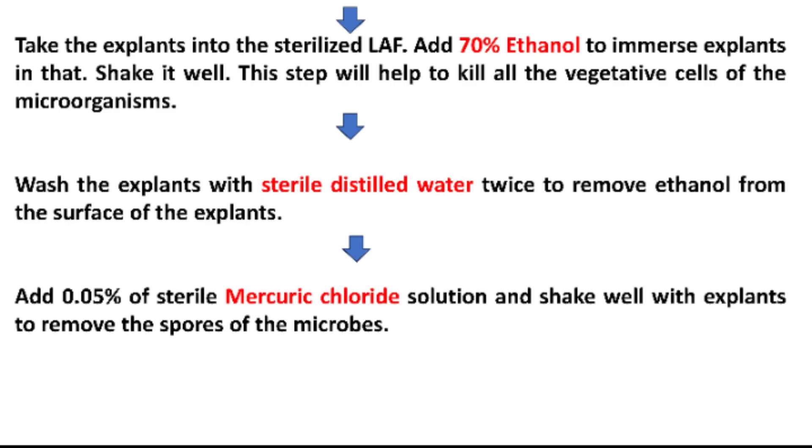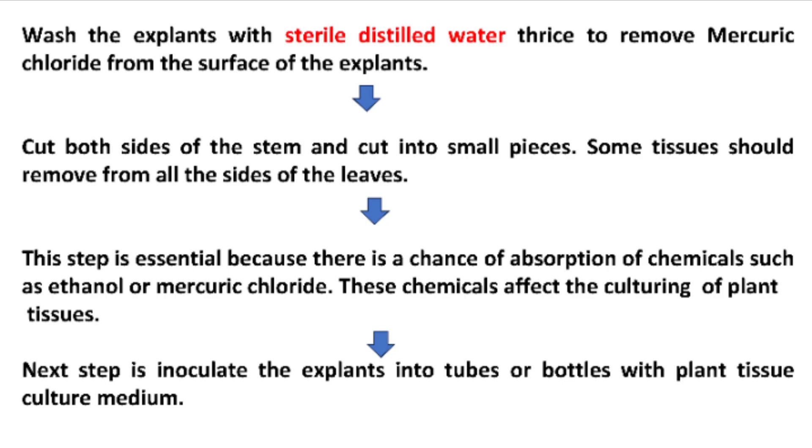Add 0.05% sterile mercury chloride solution and shake it well with the explants to remove the spores of the microbes. Then wash the explants with sterile distilled water three times to remove mercury chloride from the surface of the explants.